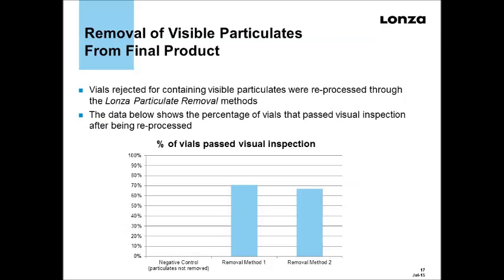Particles are becoming the bane of cell therapy today. Picture plastic processing. You are doing closed processing. That means every time you change media, you have to weld a new bag onto the system. Every time you weld, you have particles. On top of that, when you're doing 600 plastic boxes while you're making cell factories, it's a sterile weld, you actually will, again, induce particles into the system. Every single bag of media has particles in it. The bag production will leave particles in the system. By the end, you can actually do a visual inspection and have 10 to 30% of your product with visual particles in it. So if you did it no other way, that's what you can come back with.